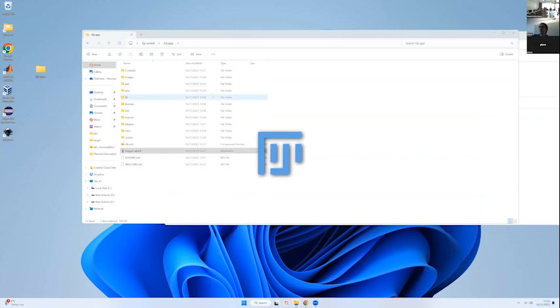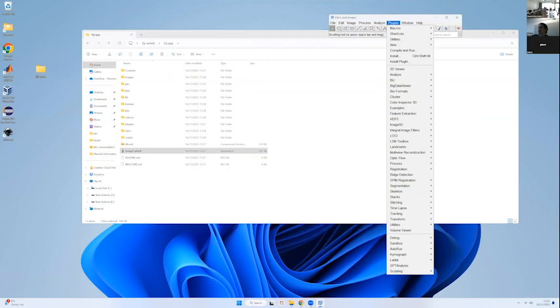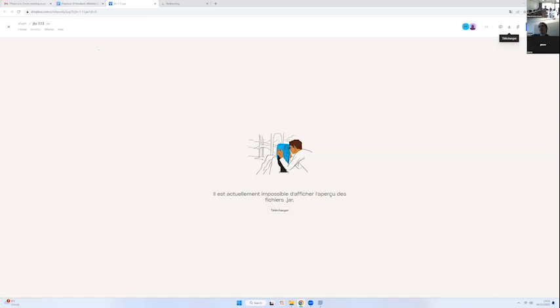Now, when you launch Fiji, you should get this SPTanalysis in the plugin menu at the bottom. If you have the version from yesterday, we will have a very slightly different version. I just corrected some bugs that I found yesterday, but more or less it will be the same. So this is for the plugin.